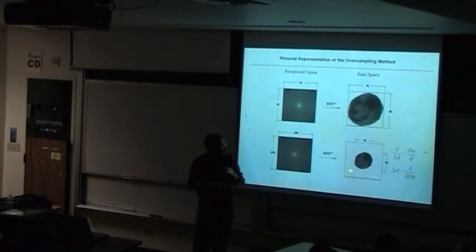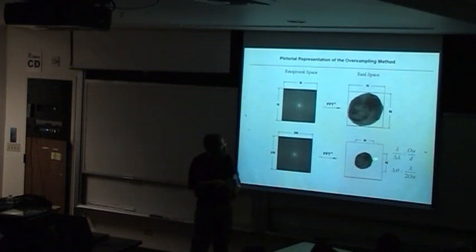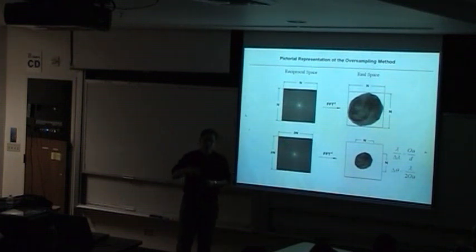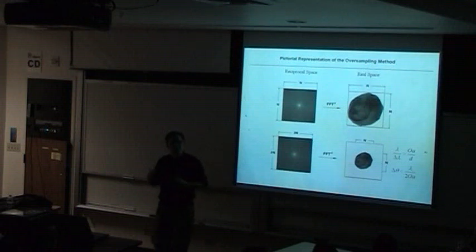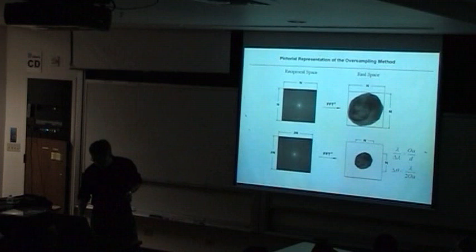Now here I want to emphasize this is pretty mathematical. If you oversample larger, this zero region is larger. But it's not free, so you may say, if I oversample, there is a trade-off. First of all, the coherence of the beam is related to the oversampling degree. If you use a large oversampling ratio, which means increasing this distance, the coherence has to be better and this angle has to be smaller. And also the signal-to-noise ratio of each pixel is lower. So it's a trade-off. What's the best optimal oversampling ratio for the experiment, right?